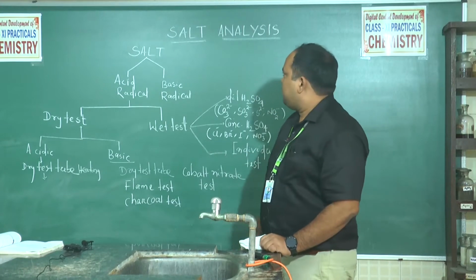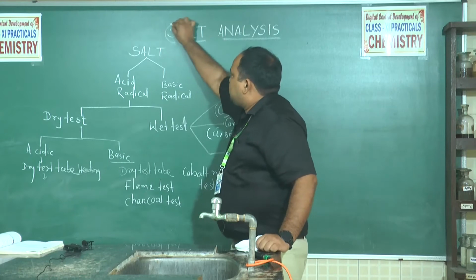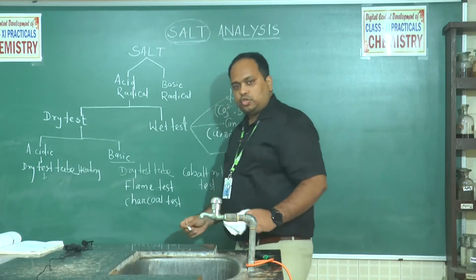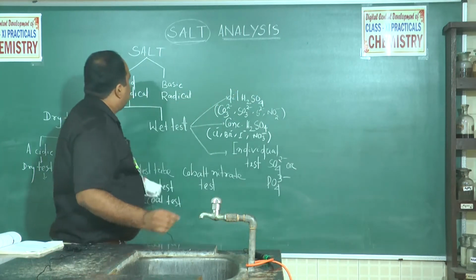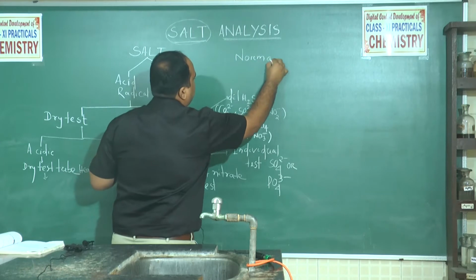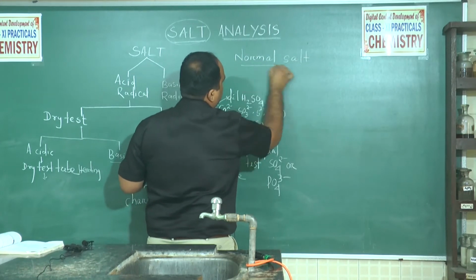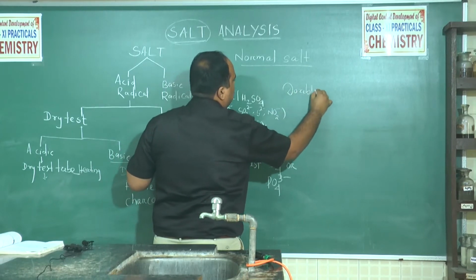Now our experiment next is salt analysis. The question is asked, what is a salt? Generally I am writing that there is a normal salt, one is normal salt or single salt, and another one is double salt.